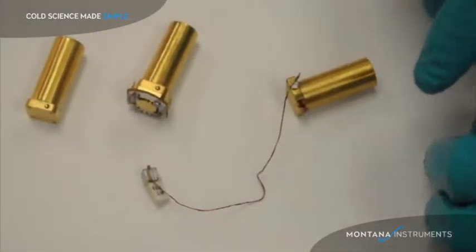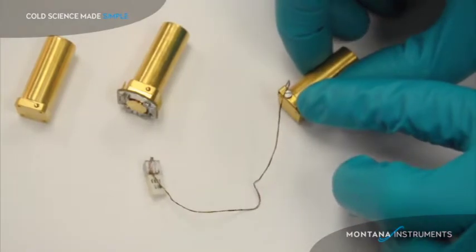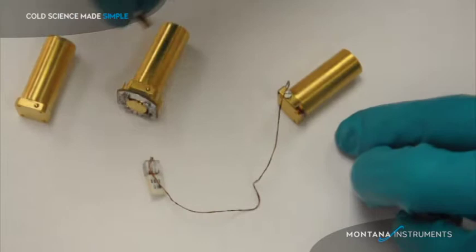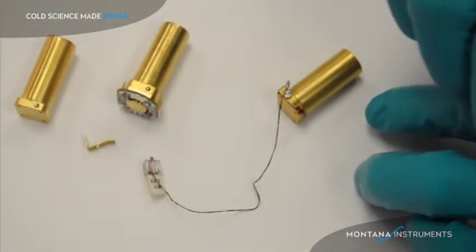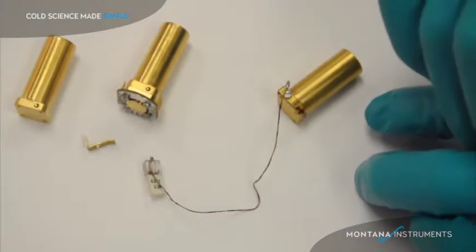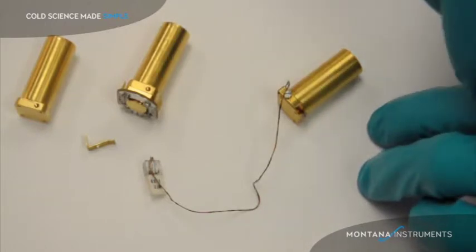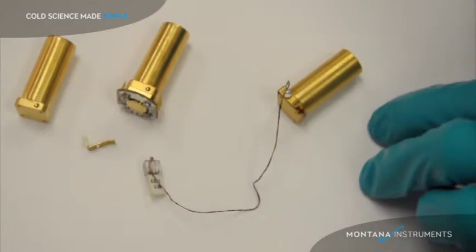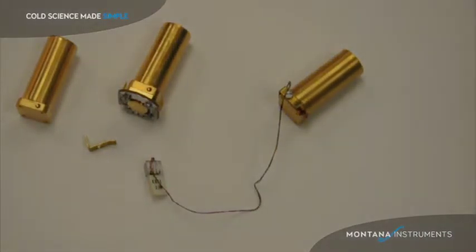I have shown these configurations on the post without a sample thermometer. Your system is provided with a sample thermometer mounted out on the sample post. It's held on with this little clip in that hole there on the side of the post. This provides an accurate indication of the temperature of your sample. If you wish to monitor the temperature of another place in your experiment, such as the sample itself, we have provisions for connecting your thermometer to our electronics so this temperature can be displayed on the user graph.